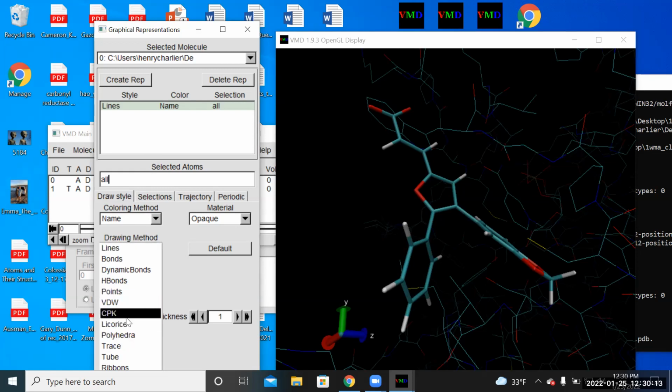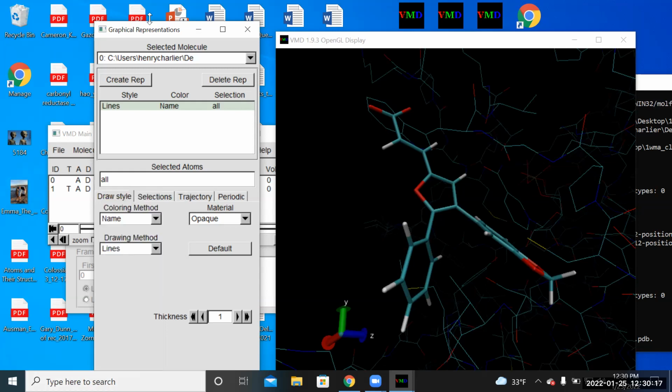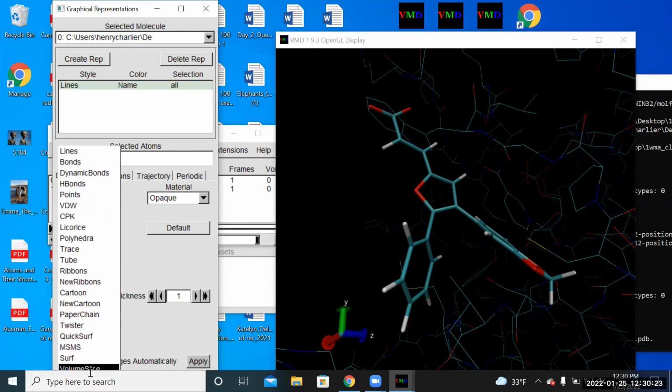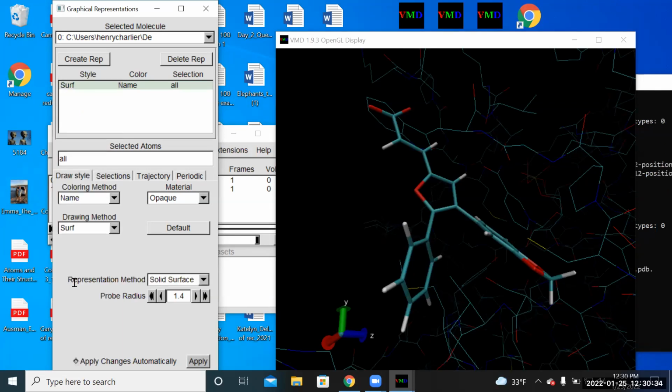This only works if you're using the clean one, no AB3, for this trick. Otherwise, it won't show up right.